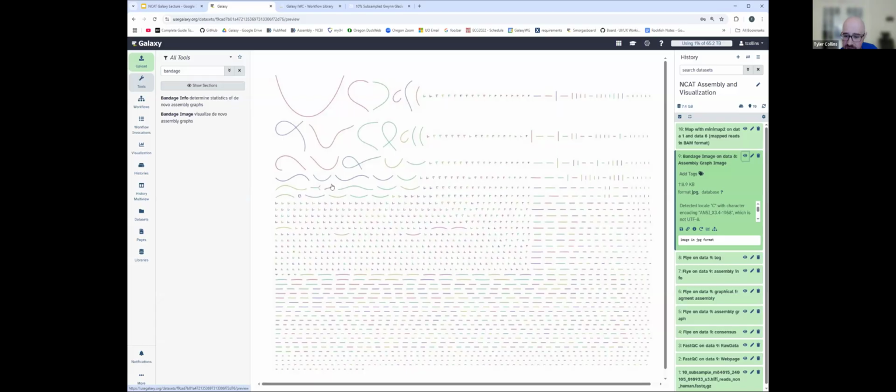And it's kind of a nice sanity check that I would often like to do after doing some form of assembly. In addition, very often other things you do after that assembly is you run a lot more quality control metrics and some other things. You might want to run Quast. You might want to maybe run, if you think you have a complete genome, some kind of BUSCO analysis to try and estimate how complete of a genome you have, things like that. But those will be a little out of the scope of at least the demo of what we'll be running through today, just for time purposes.